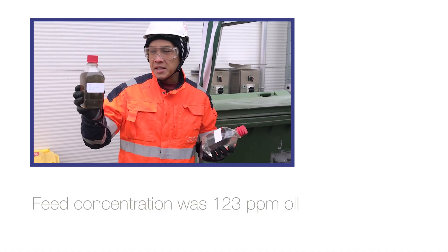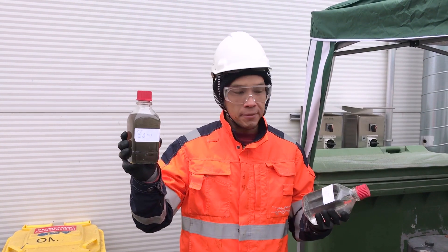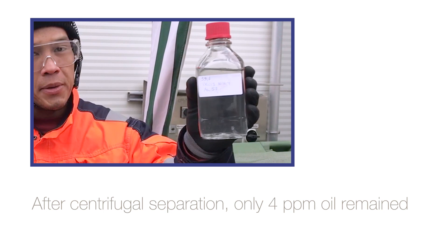So here we see this is the inlet coming into the Explorer — this is out of the customer's walnut shell filter. And this is what we get out.